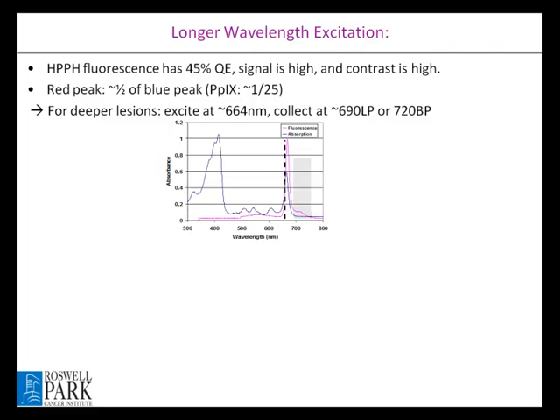Now, for the long wavelength excitation, the question will be whether you can see a signal. There is less absorption, but do you have enough excitation? Actually, it turns out that for HPPH, it is more than enough because it's not like PpIX. People over here work a lot on PpIX. In PpIX, this peak versus this peak is like 25-fold. But in HPPH, only about 2-fold. The quantum efficiency of the fluorescence is very nice.